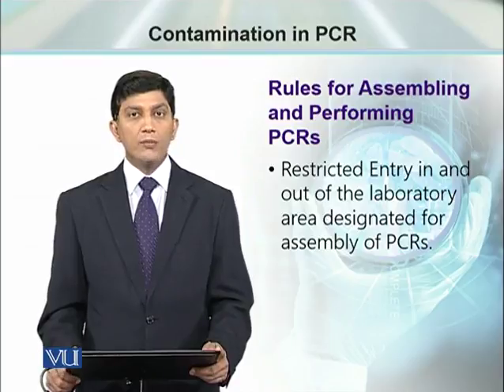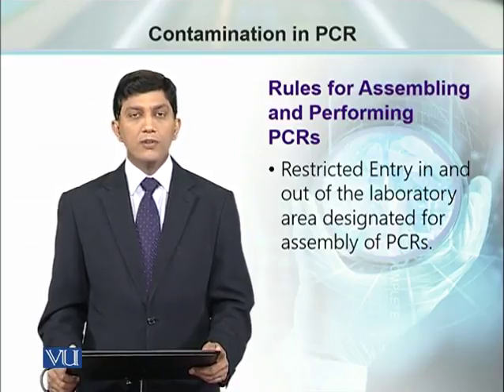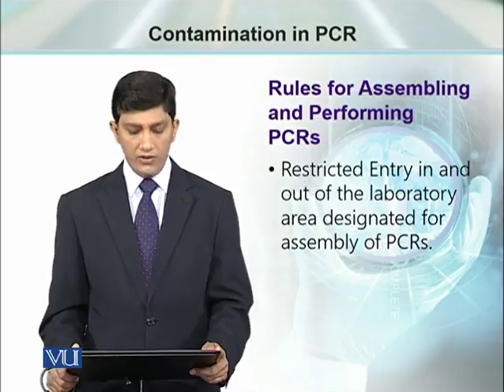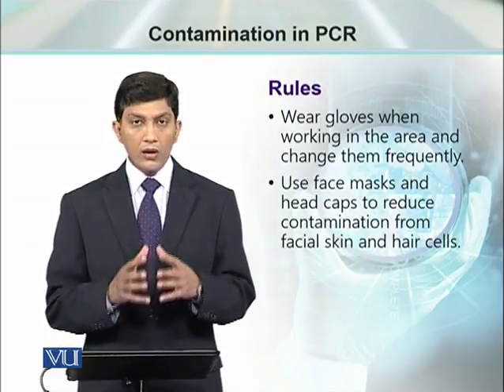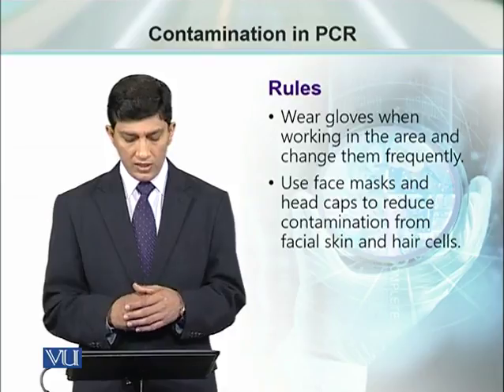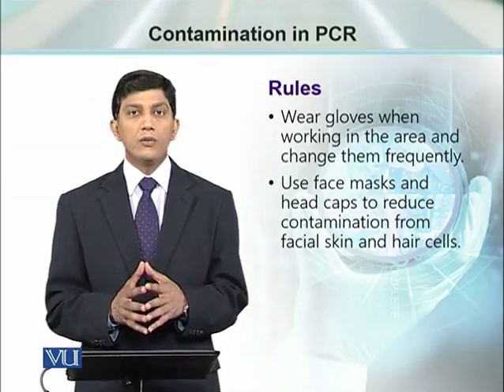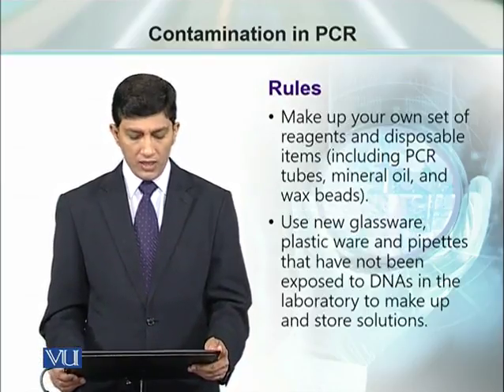While working in the lab, you should follow some rules to set up the PCR. There should be restricted entry in and out of the lab while setting up the PCR. Always use gloves. Frequently change the gloves during the PCR setup. Use a face mask or head cap so as to avoid any kind of contamination from hair or skin cells.